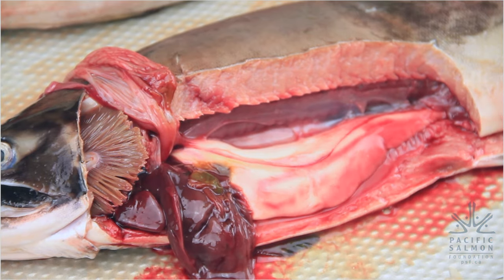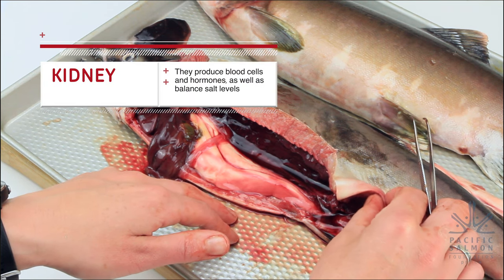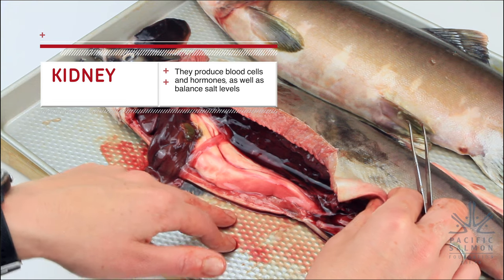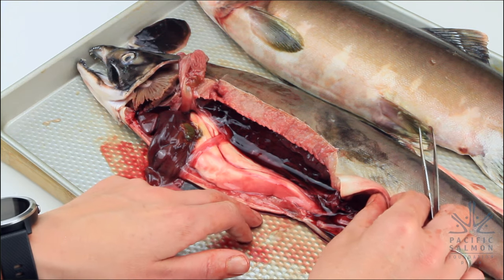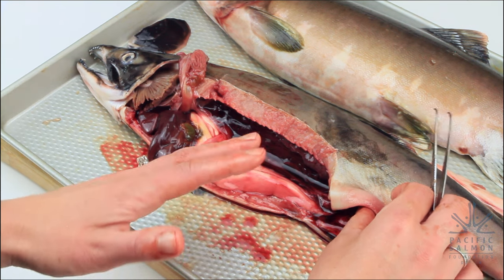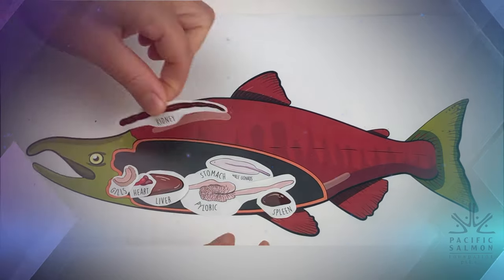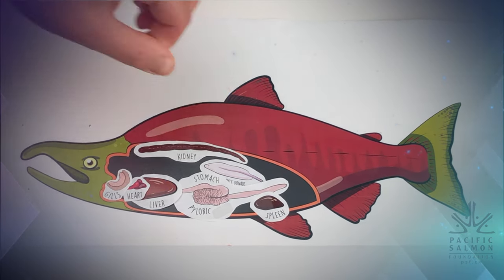Salmon have two kidneys: an anterior kidney, which functions to form red and white blood cells and is where hormones are produced; and a posterior kidney, which is responsible for balancing the amount of salt and water in the salmon. Find the kidney in your diagram, cut it out, and put it in the correct location inside your fish — it goes at the top, just below the spine.